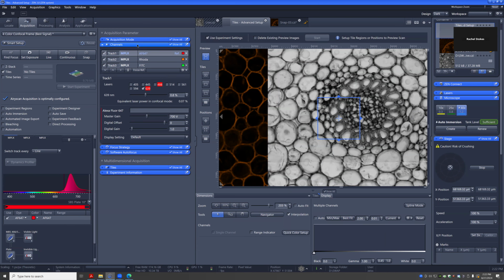Generally, I'll put the speed to the maximum here so we can crank out the most speed. You can actually see on that 8Y, the fastest mode, at maximum speed it's around 300 milliseconds for our current frame. Actually, this is a 2x zoom. So for scanning, that's really nice and fast, especially compared to confocal.